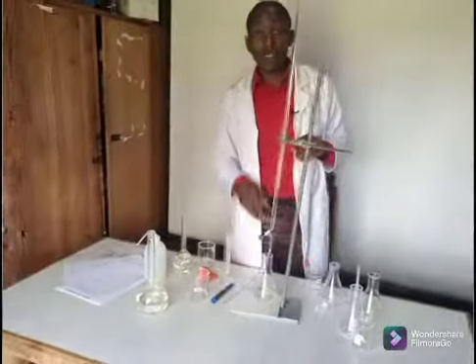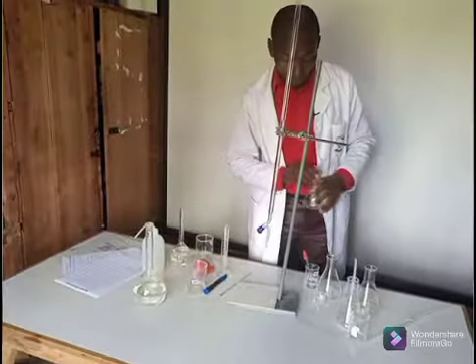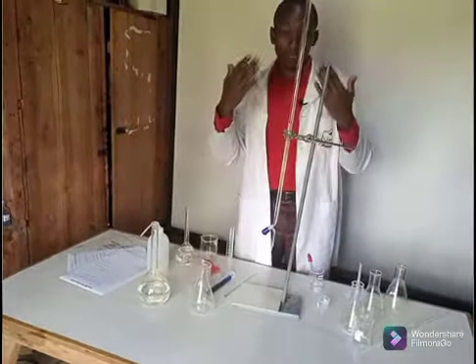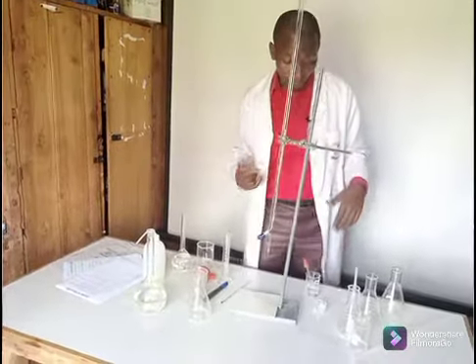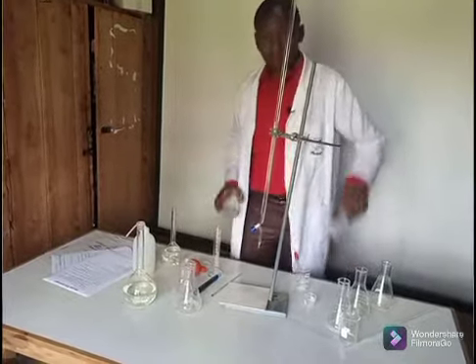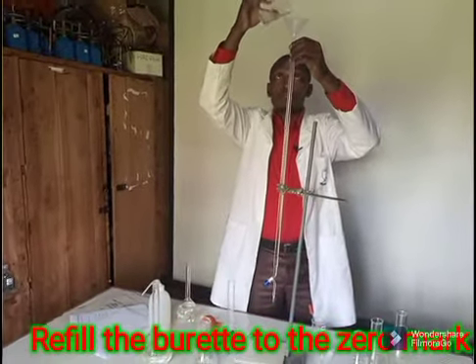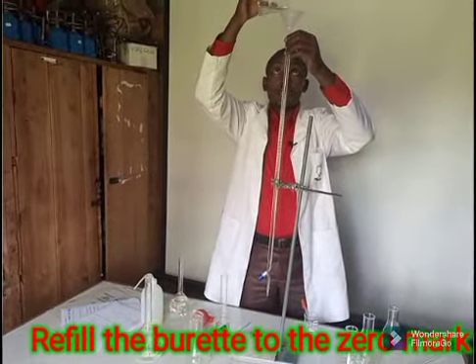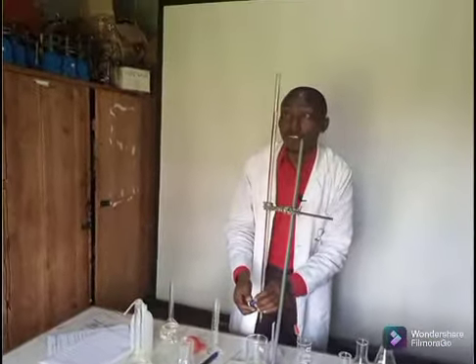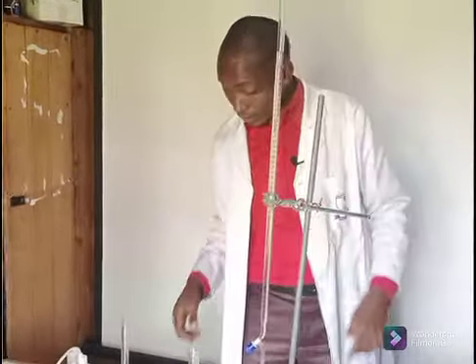And just to be very sure and more accurate, I need to do 2 more trials. So that is the first one. I can go for the second one. Remember now my volume is beyond 25, so I should top up. I take my solution R and refill the burette to the zero mark, and adjust so it is exactly at zero.